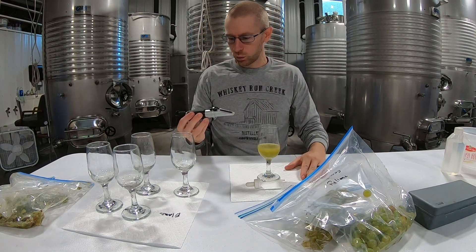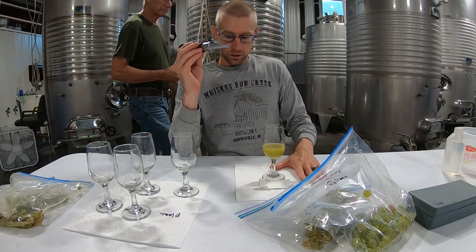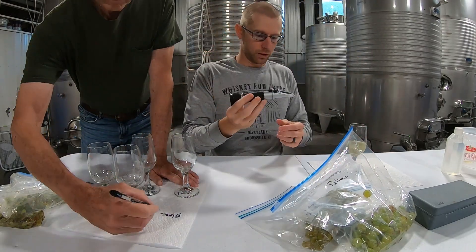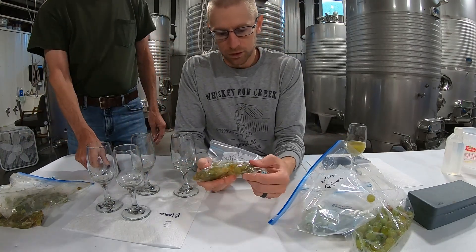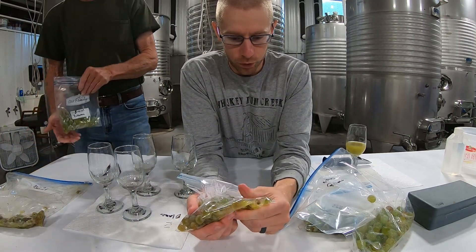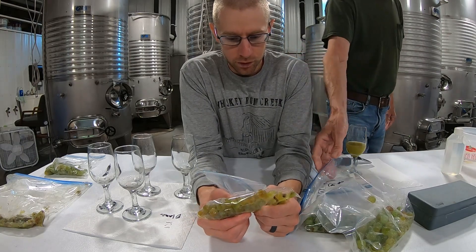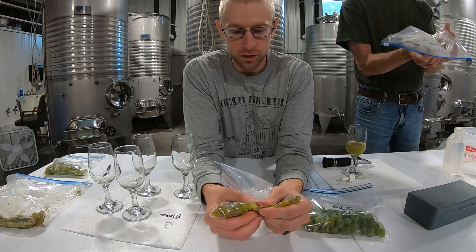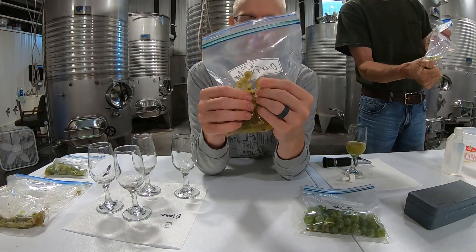So that's what the Brix are on it — this is what reads the Brix. We'll jot down that it's 17.8. Then to smash the grapes, you just go through and smash each individual one, try not to break the bag. You just work your way around the bag until all of them are smashed.